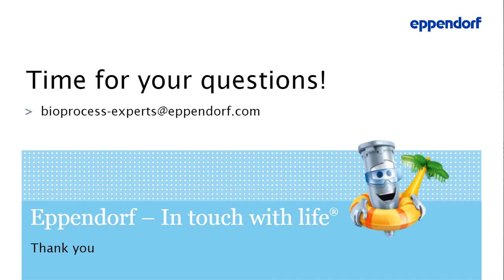Insert the sensor into buffer solution 7 and wait at least a couple of minutes, or 5 minutes or so, until the values for the pH sensor stabilize. The idea is that if the sensor is hydrated properly and stored and maintained correctly, then you should be able to avoid fluctuations during the calibration process.